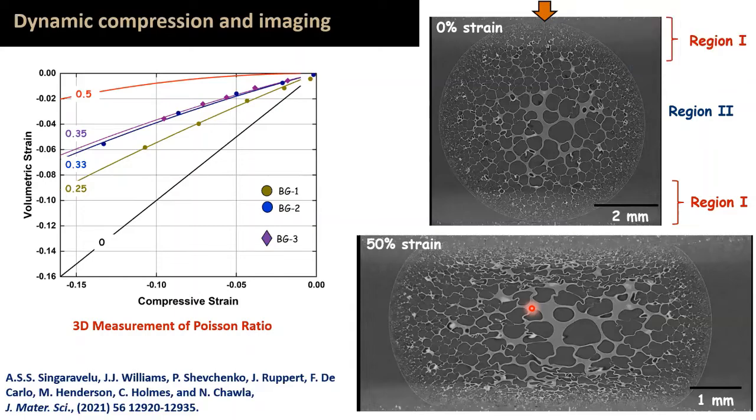There was one trip that we made where the X-ray shutter was on throughout the 4D experiment. And there you could see that the beads were significantly damaged. They became discolored and became extremely brittle. You could break it with your fingers. So it's something you need to be concerned about. But if they're very short bursts of X-rays, and the experiments are relatively short, on the order of a few seconds, then you can minimize that X-ray damage. I see. Thanks. But that's a great point, and especially with polymers, it's something that one needs to be concerned about.